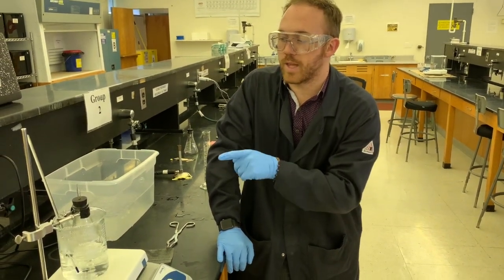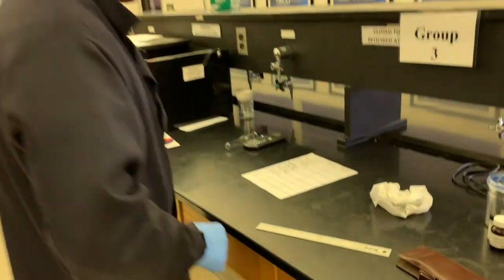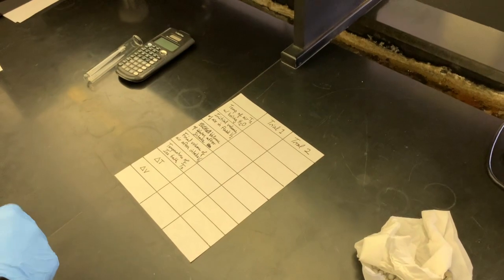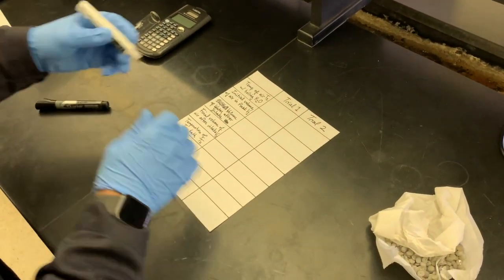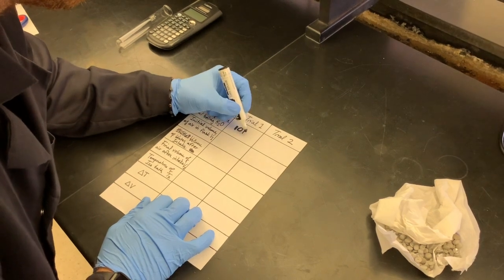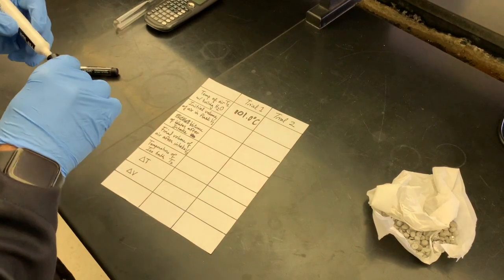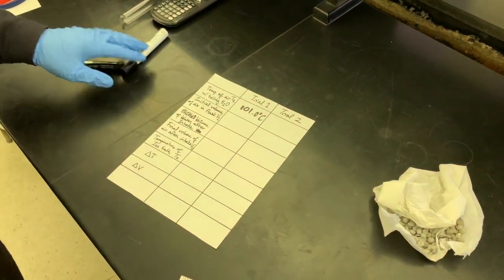So I'm gonna record that, then I'm gonna move this just in case I forget. So let's see. Lost my good marker. So it's gonna be 101 degrees Celsius, 101.0. I really keep those sig figs if you can.